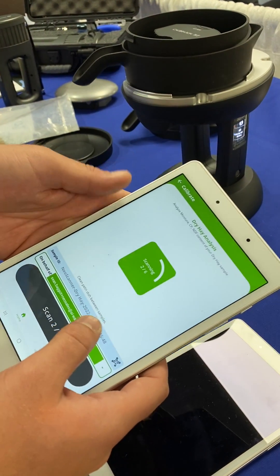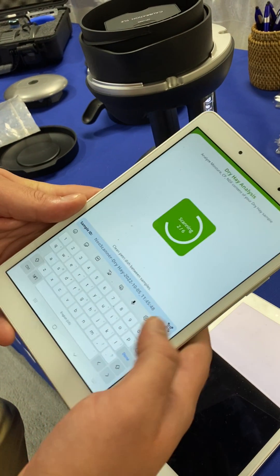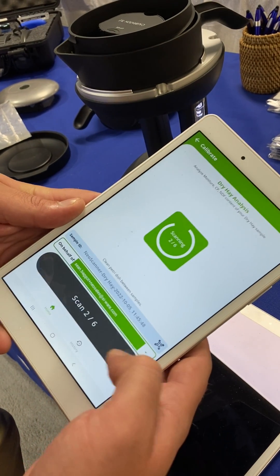Here below you can customize your sample ID as well as change the operator of who is using the scanner.